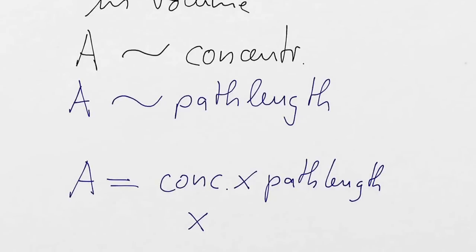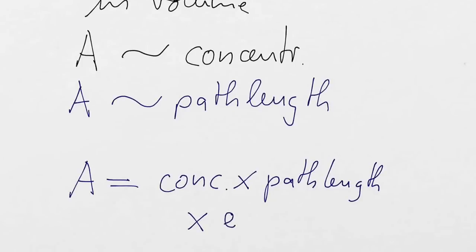And we just simply call this thing, what do you want to call it, this factor? Henry? Hugo? Matilda? Well, actually, the chemists call that an extinction factor.